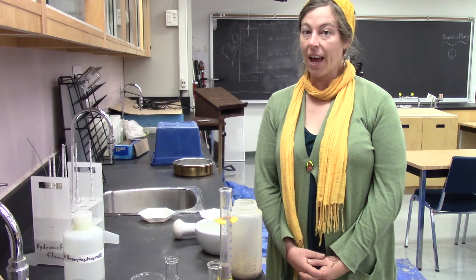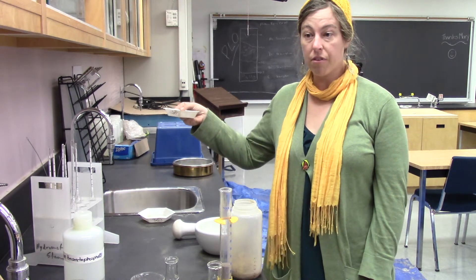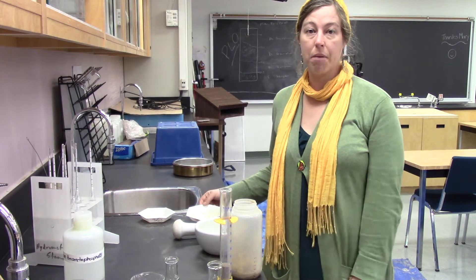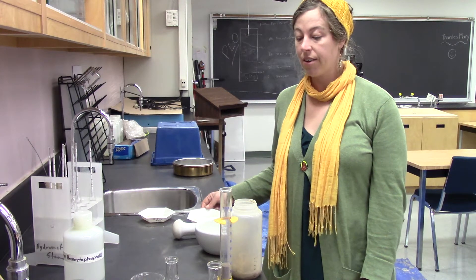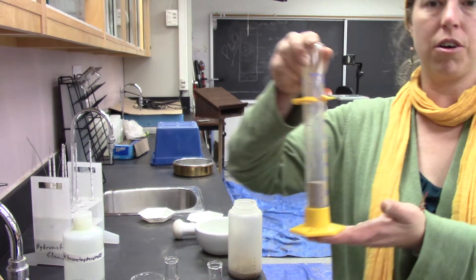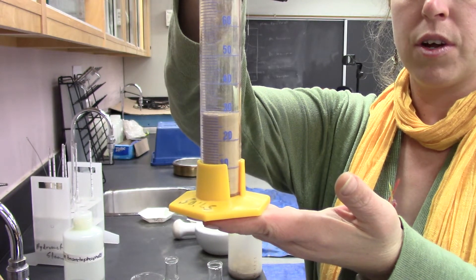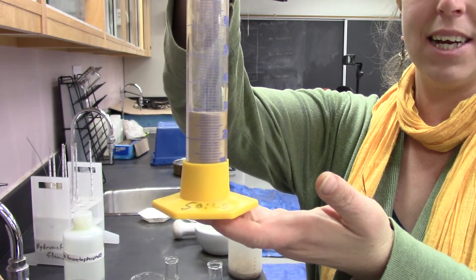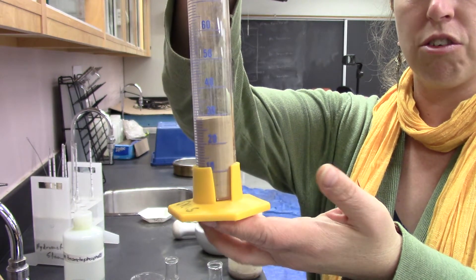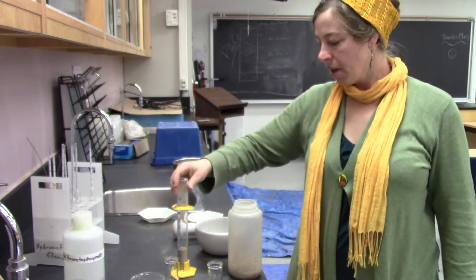Start with getting a soil sample. I started with 50 grams of soil, just like I did in my hydrometer video. I've put that 50 grams into a measuring cylinder and currently I have 29 milliliters of soil in here.